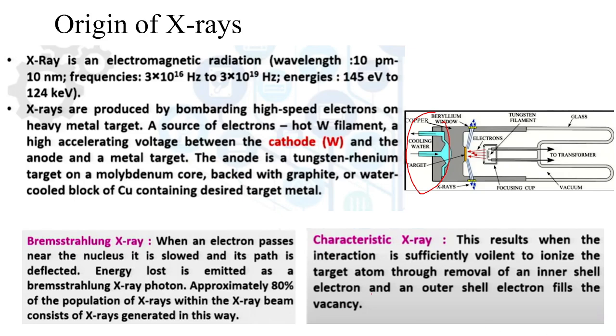And there are two different X-rays, hard and soft. For hard X-ray you need copper or tungsten, those heavy metals, or soft X-ray can be generated from aluminum or magnesium, etc.